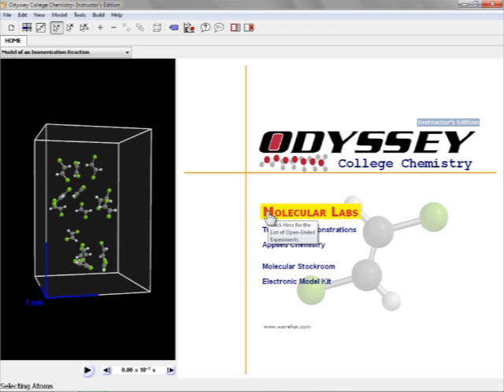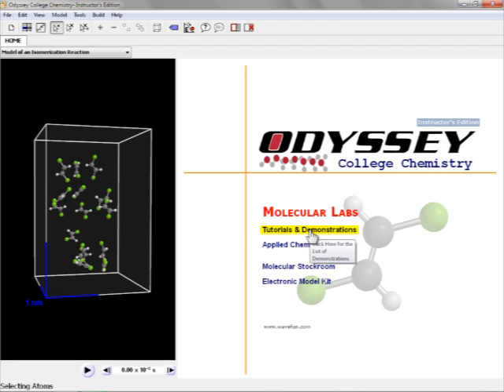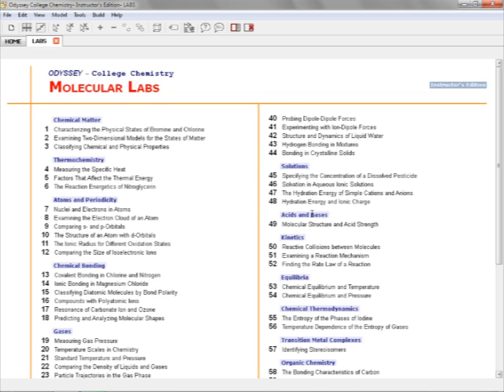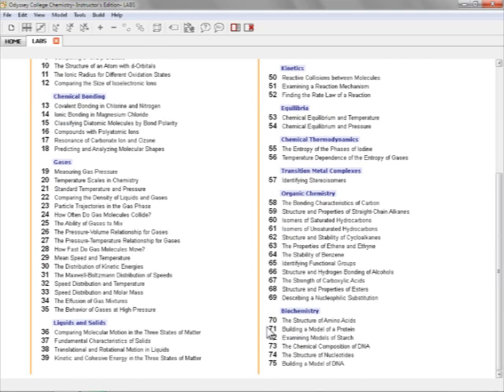So this is the Odyssey software. This is the college chemistry version. There's also a high school version. In each version there's a modeling kit, a stock room, applied chemistry, tutorials and demonstrations, and molecular labs. We're going to focus on the labs. When you open up the lab section, it's broken up into different chemistry concepts from chemical matter down to biochemistry. We're going to look at gases and the pressure-volume relationship for gases, just like with the experiment we did with the PESCO equipment.